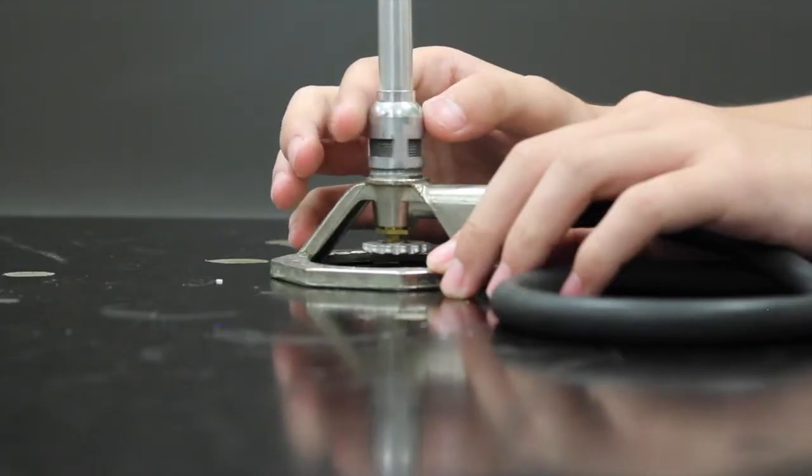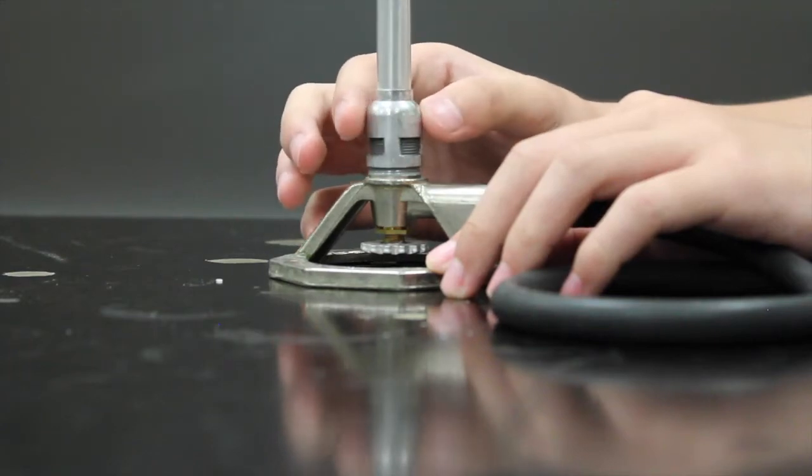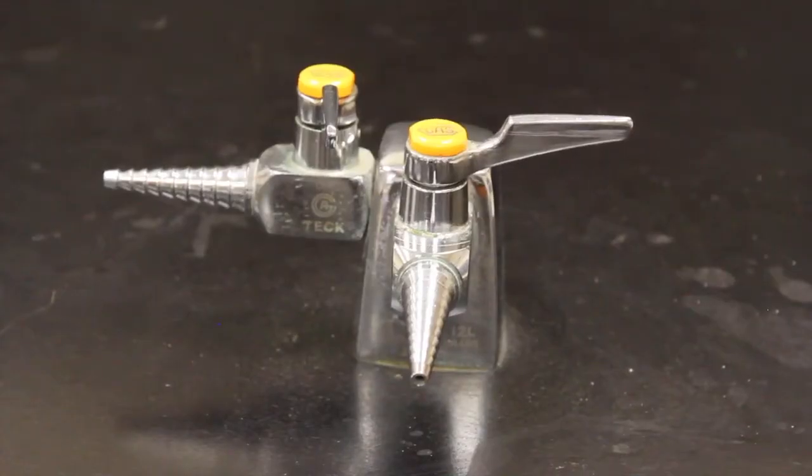Next is Bunsen burner and glassware safety. The Bunsen burner is an open gas flame that ranges to very high temperatures and is one of the primary heat sources in a chemistry lab. Although, if not used properly, there are many dangerous outcomes that may occur.